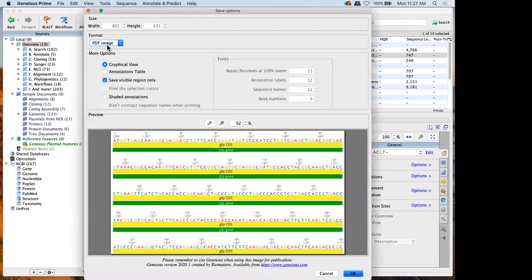So you can export out to various file formats. Some of these are vector-based file formats, which means you can edit them, and if you resize them, it keeps that resolution. One of these in particular, you can export out and you can actually bring it into PowerPoint on Windows. If you right-click and do Ungroup, you can edit the file format within there, within PowerPoint, so you don't even need access to fancy graphics software. I believe it's the EPS file format, but I might be wrong there. It is mentioned on our support site exactly which one that is.